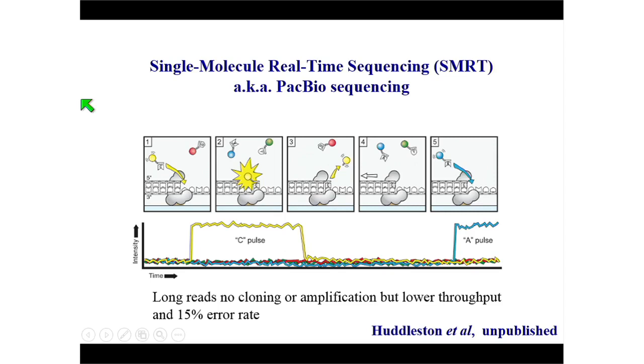It then becomes cleaved and moves away from the area where it can be detected, the DNA molecule translocates, a new phospholinked nucleotide comes in, and a new pulse is initiated. The signature that you get is very different from what you're typically used to. But imagine this ZMW, 150,000 of them, and now there are machines called Sequel that have on the order of 1 million, and you're doing this simultaneously. You're capturing DNA sequence in real time.